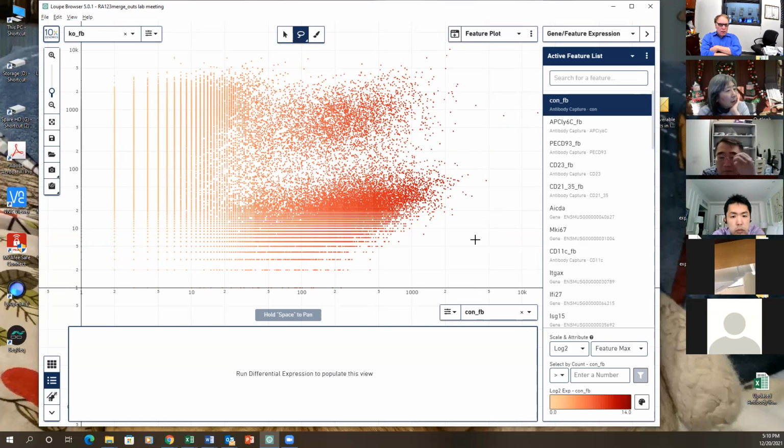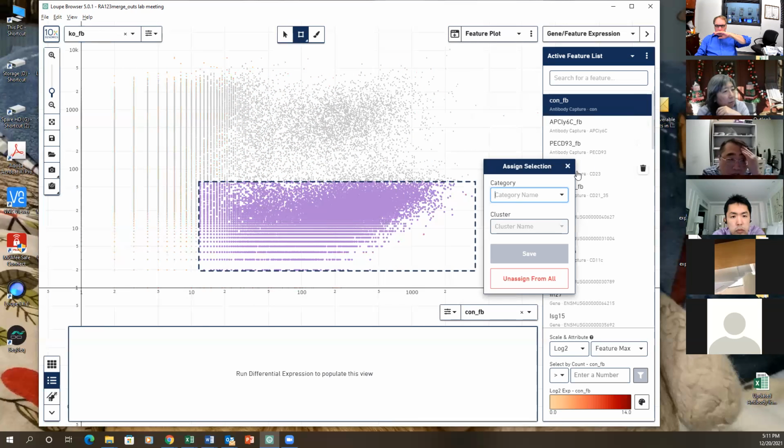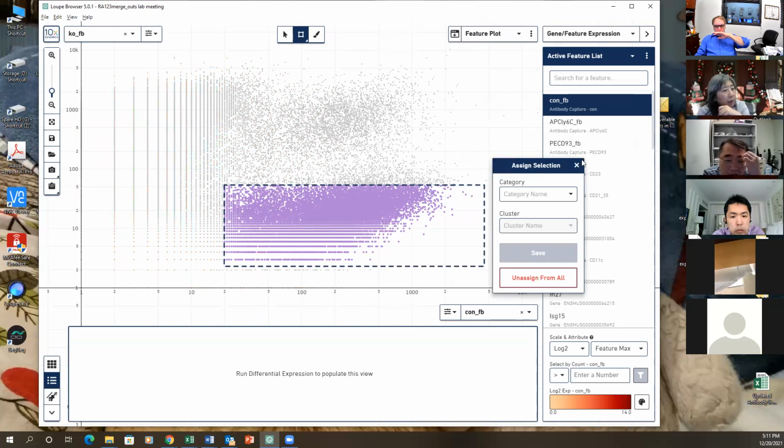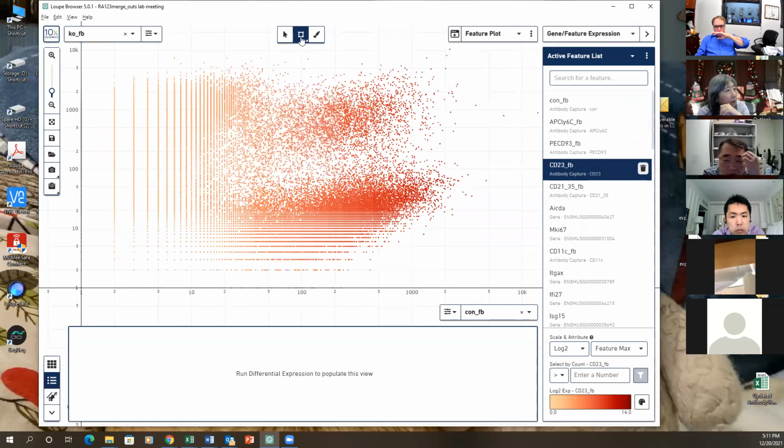I feel it's better we separate them, so you know where you want to cut off. Somehow the knockout doesn't. This is not behaving. Which software? Your software is 5.0 right now. It's version 6. I see. It's not behaving right. I cannot really get it right.